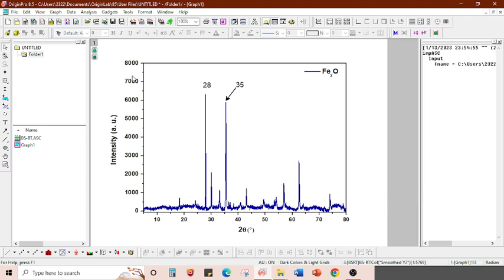So now I'm going to recheck it. This side it is 20, this side it is 18. So I'm going to increase this, both have to be uniform to look symmetrical. And this side it is 22, and here it is also 20. Font here is 22. For example, 22. So this has an arrow, this doesn't have an arrow.